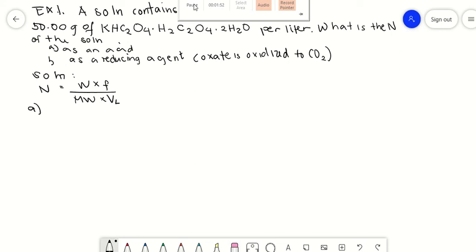So if your oxidizing agent is potassium permanganate, your reducing agent is ferrous salt. Potassium permanganate and sodium oxalate is also another combination. Iodine and sodium thiosulfate, if you recall your activity in the lab in general chemistry, hypochlorites and arsenious acid as well is one combination.